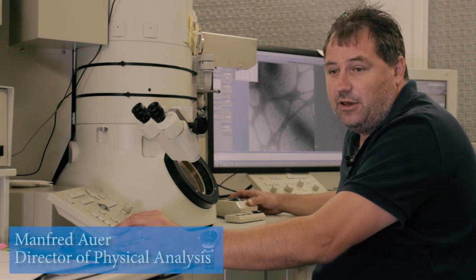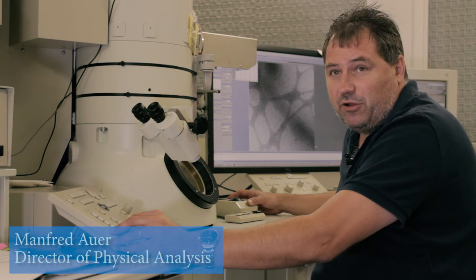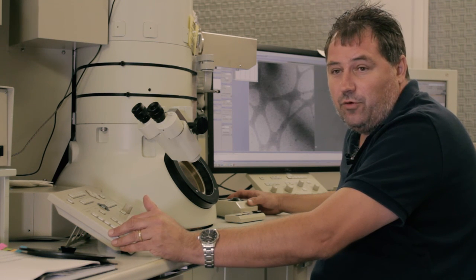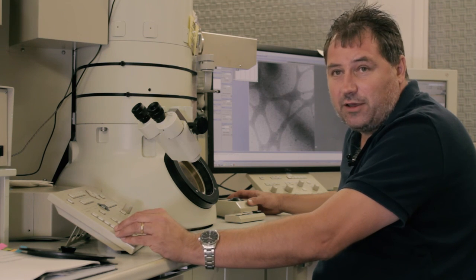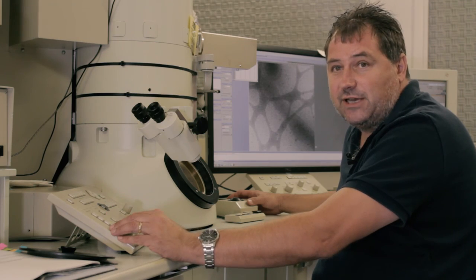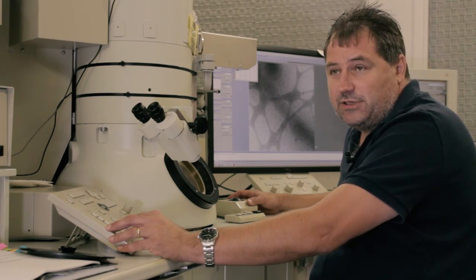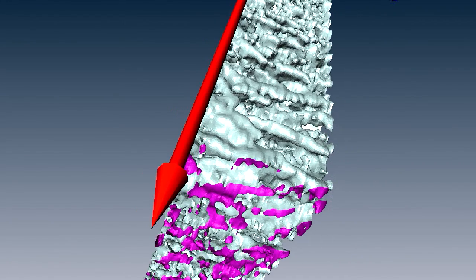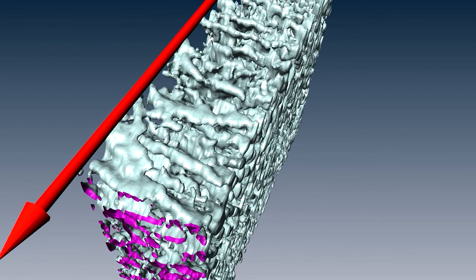One of the key concepts here is to integrate multiple imaging modalities into an entire workflow and to go across multiple scales. So we are not just able to look at macromolecules, we're not just able to look at organelles, but we go all the way to cells and even tissues. This concept of integrated bioimaging is really one that's emerging now and requires a lot of method development, which we are currently and actively doing.